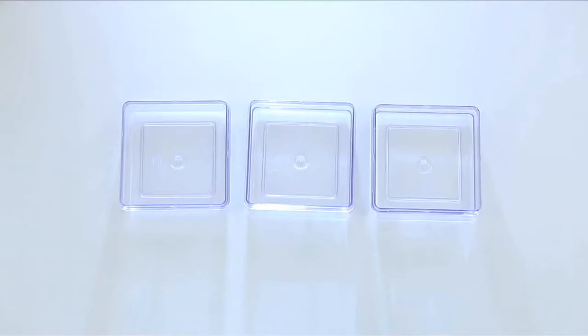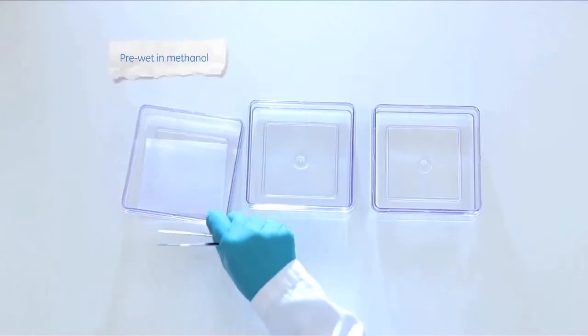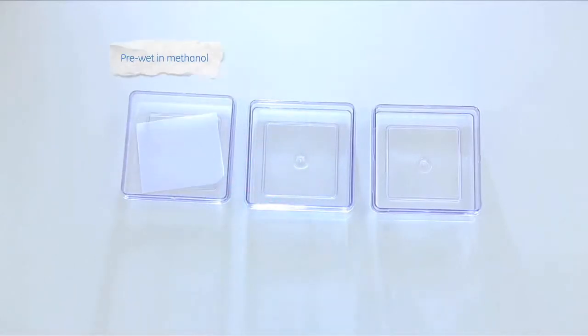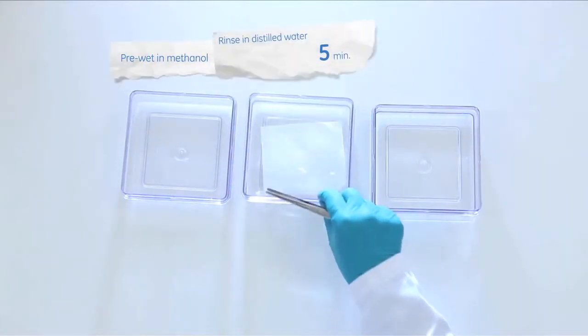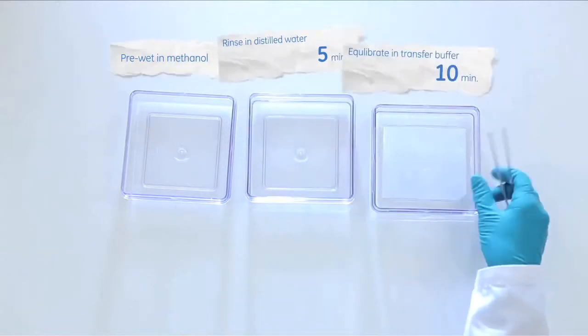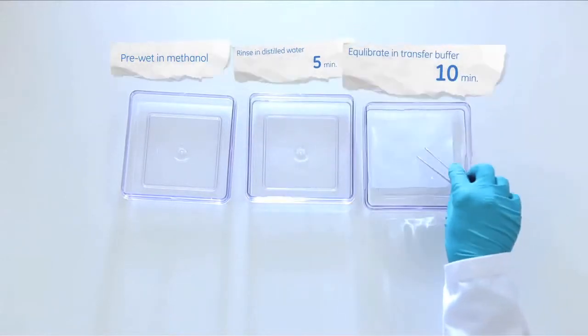As with all PVDF membranes, the GE High Bond P blotting membrane must be pre-wetted in methanol, rinsed in distilled water for 5 minutes, then equilibrate it in transfer buffer for 10 minutes.